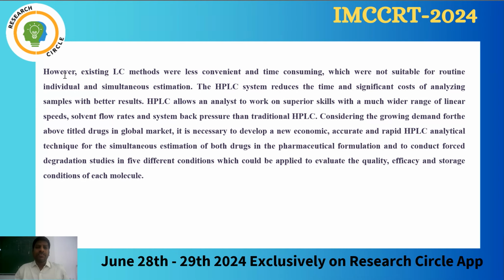However, the problem statement is that the existing LC methods were less convenient and time consuming, and not suitable for individual and simultaneous estimation. Simultaneous estimation means at a time we can determine more than one drug. So this selected combination has two drugs, allopurinol and Lesinurad.